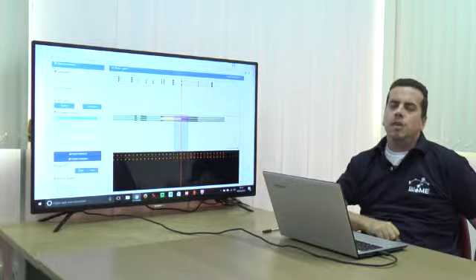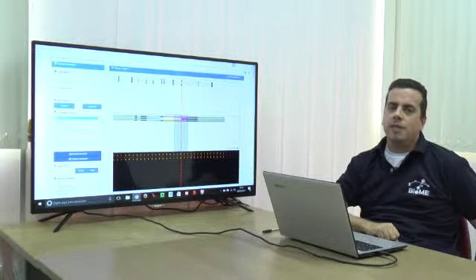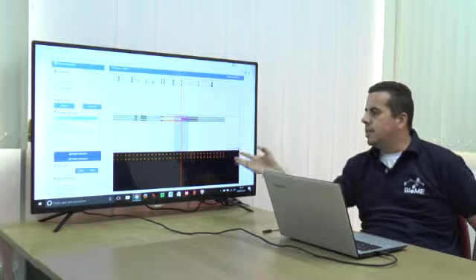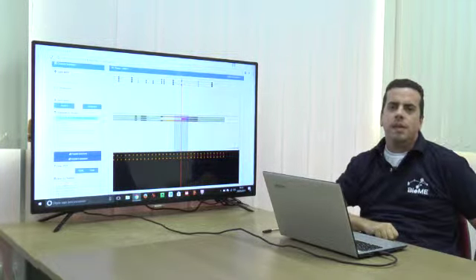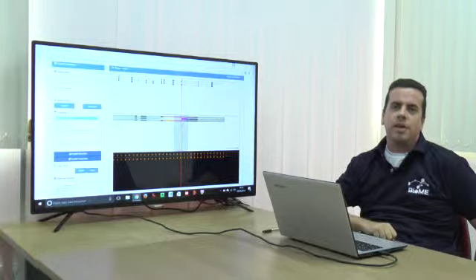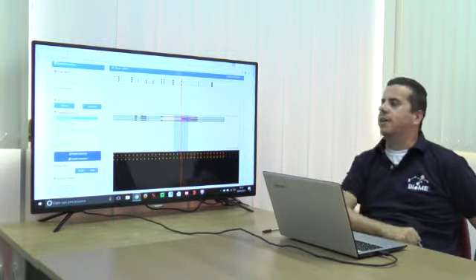Our aim here was to develop a very user-friendly tool where you could upload your proteomics data and easily retrieve all the information needed for proteogenomics. This would be easily accessible through a few clicks, and you could see all the information you need to get a proper validation of your data.